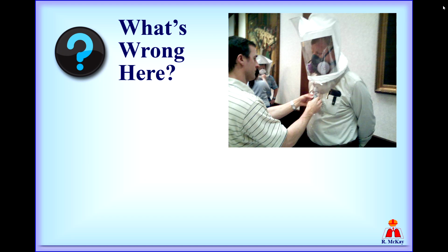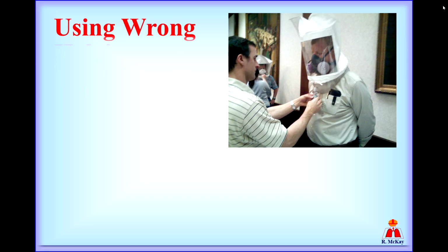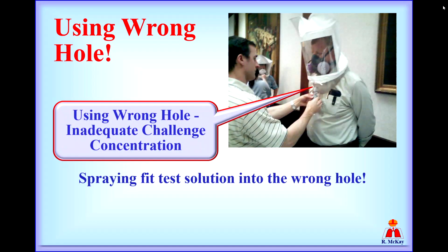Here's another example of a fit test being conducted incorrectly. Can you see what's wrong here? Well, the answer is there are two holes on the front of the enclosure, and in this case, the operator is spraying the aerosol into the wrong hole. In this particular example, the aerosol is being sprayed into the hole at the collar that's resting on the worker's shoulders. Above that, and directly opposite the respirator, is the correct hole where the aerosol should be delivered so that you can challenge the facepiece seal. This is not that uncommon.